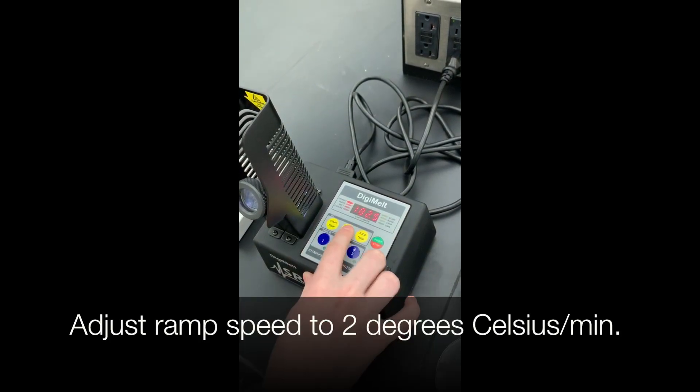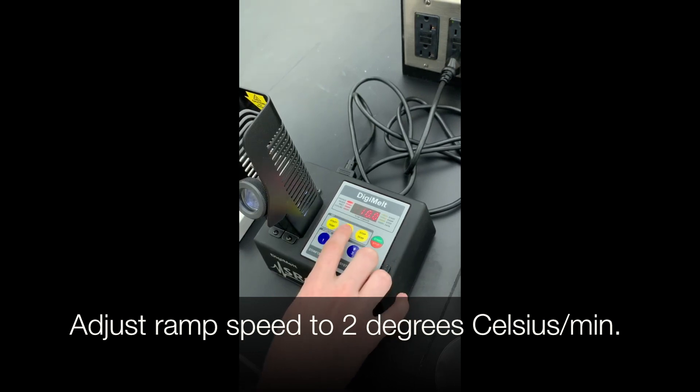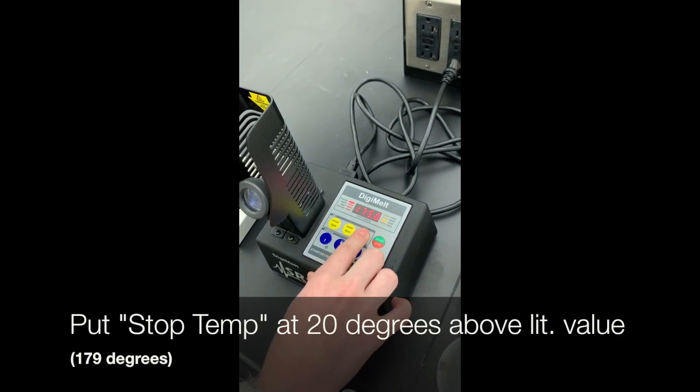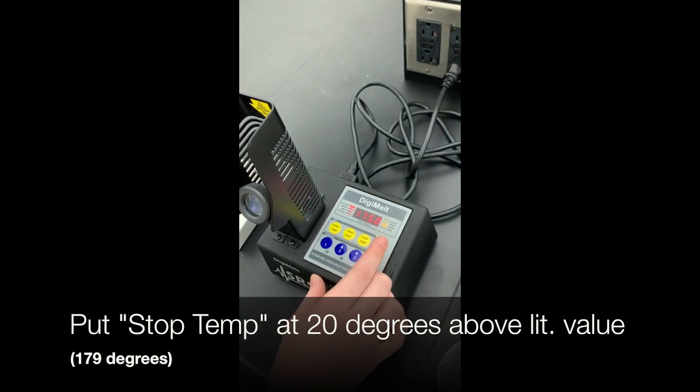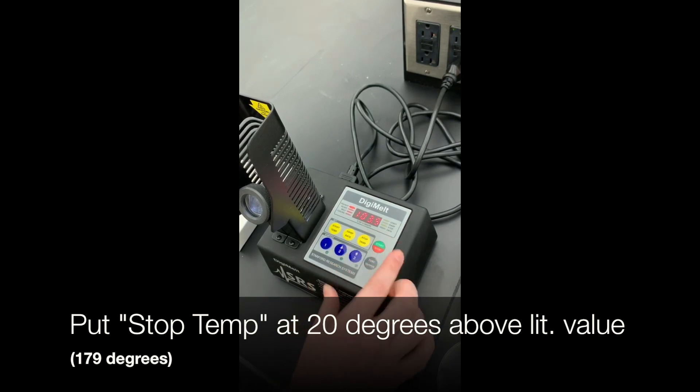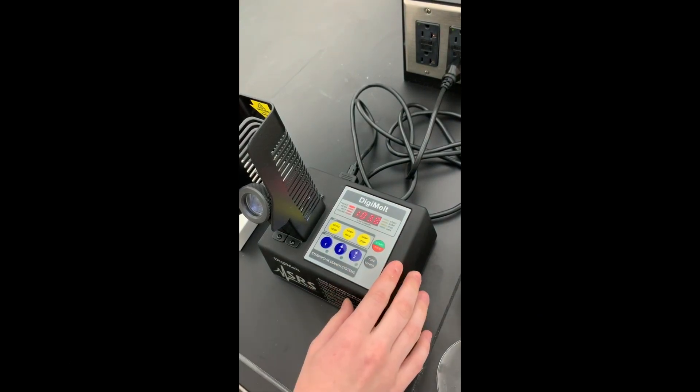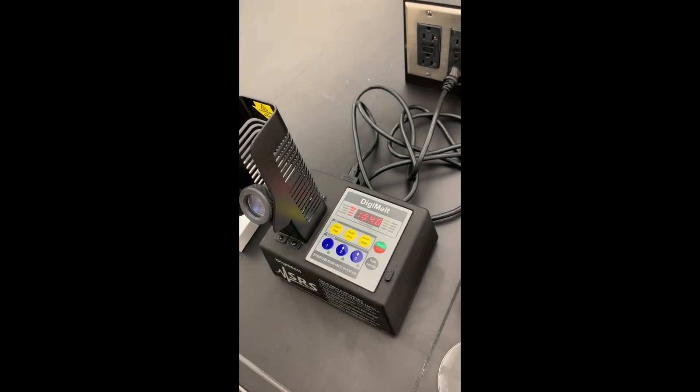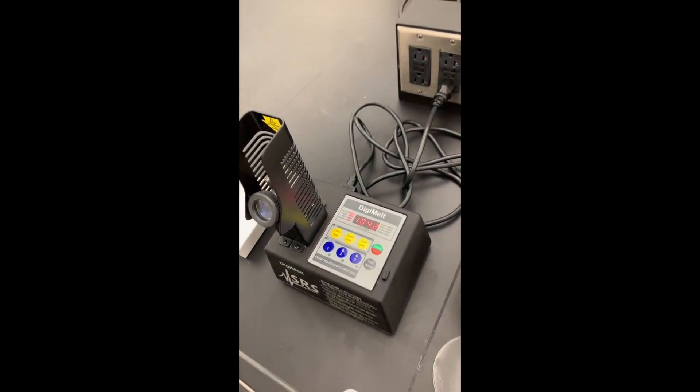To set the ramp rate, press ramp rate and use the arrows to change the degrees per minute to 2 because you don't want it to take all day. Do the same thing to set the stop temp around 20 degrees above the literature value, although you probably won't need it to go this high. Once you've done this, press start again and the apparatus should begin to preheat.